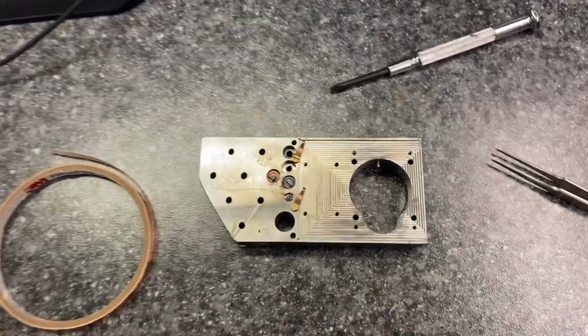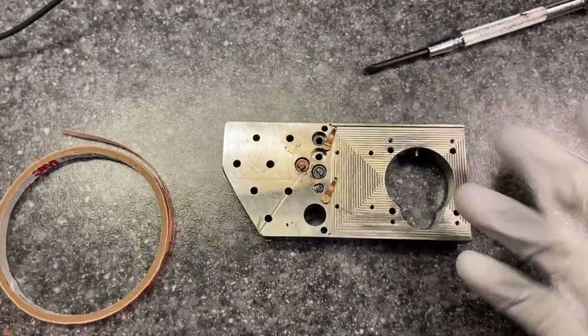So with that, I'm just gonna go back to putting the sample in the chamber, and then you'll get a first-hand view of how I actually operate the SEM to classify samples. All right, so here is the holder. It's not a very large holder, it looks like this.